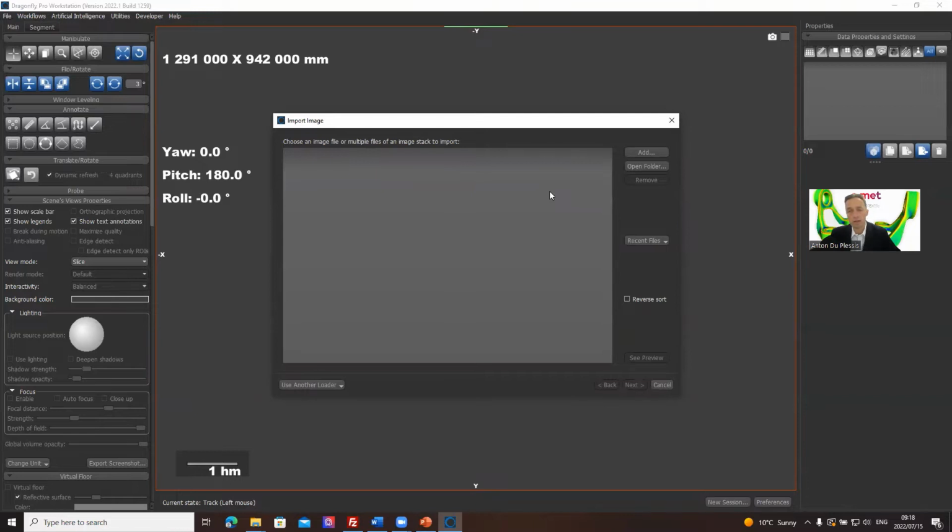It can be an image stack, or a micro CT scan from a commercial vendor. For example, we load typical Echelon and Zeiss formats, also the VGI format and many other formats. We simply decode the header information, and if your format doesn't work, let us know and we can include it.